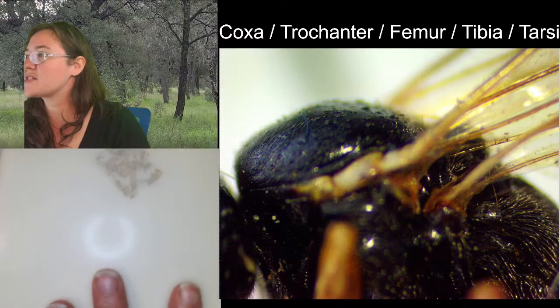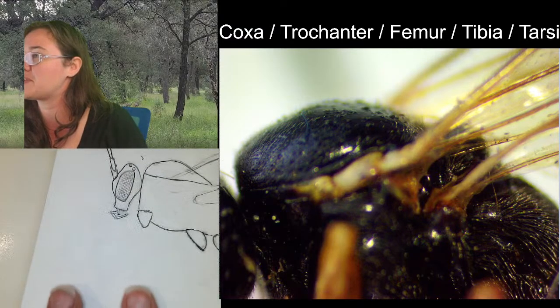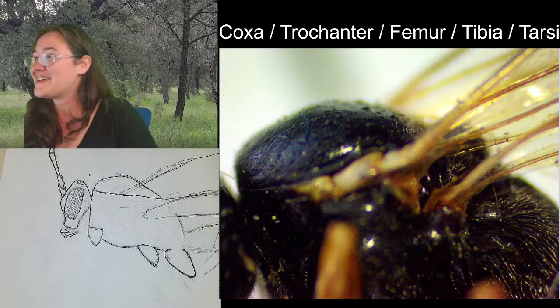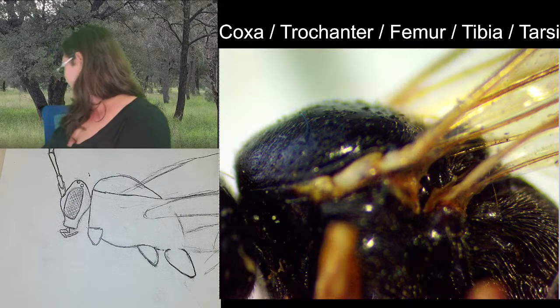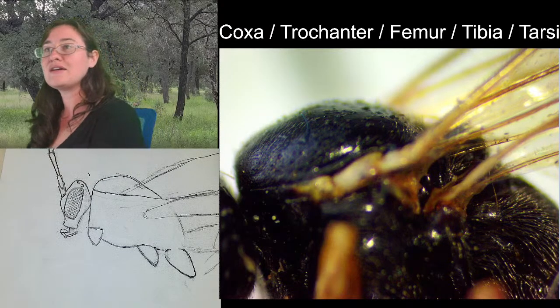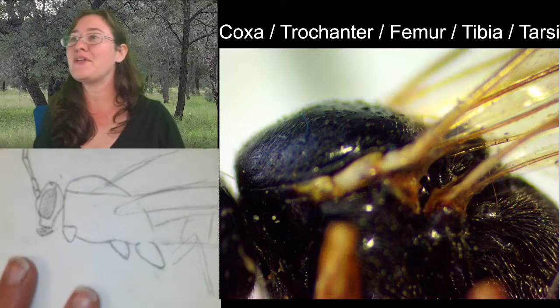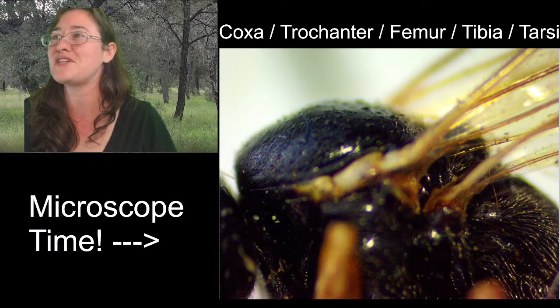With this wasp, you can actually see clearly where the wings are attached because there are separate lumps for the three segments. True. Exactly. Someone needs to edit the Wikipedia page about insect wings. Does it really say that the wings are on the meso and the meta? I'd be willing to go over there and change it if it had incorrect information.